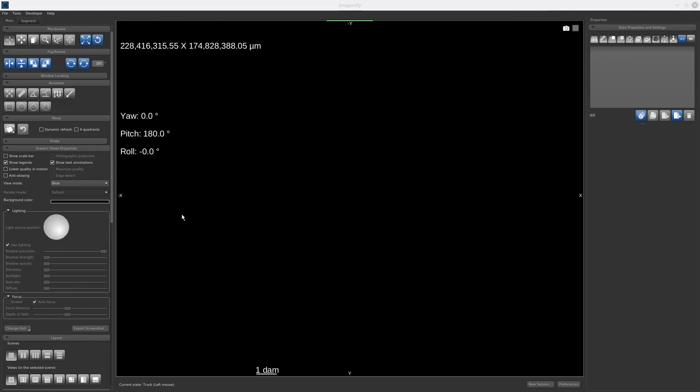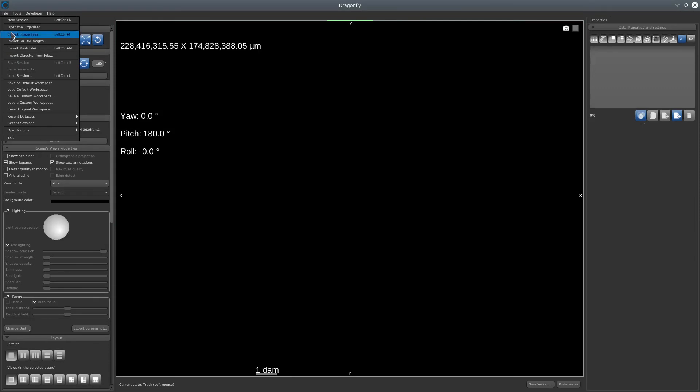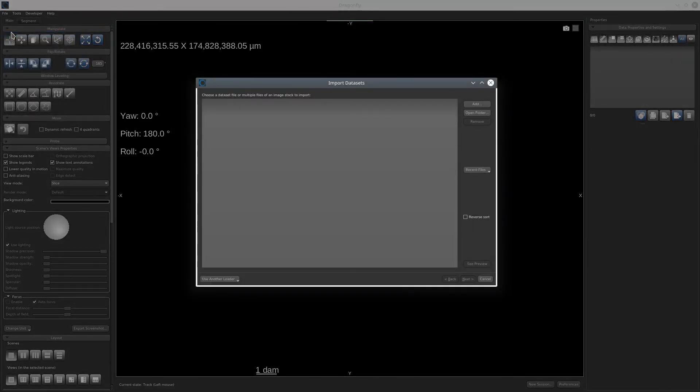First of all, let's import our dataset with the image loader. To do that, you just need to go on File, select Import Image File, and then click on the Add button.